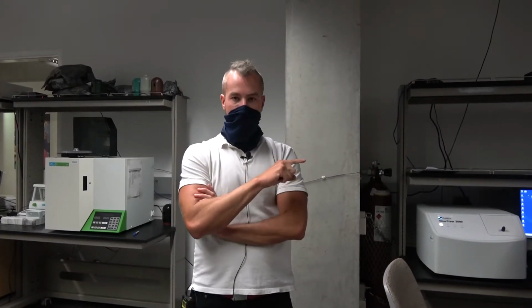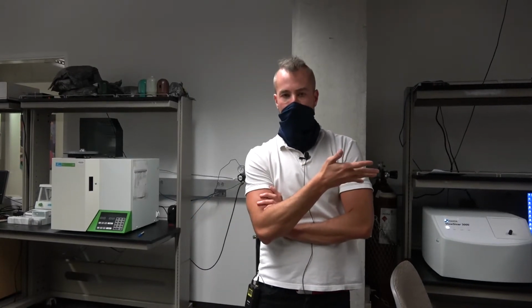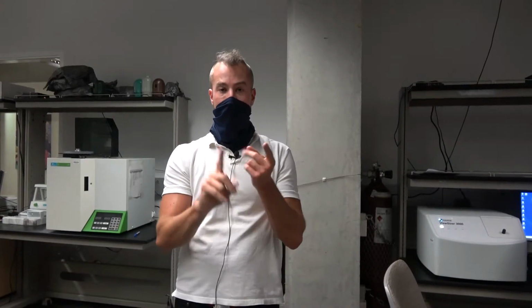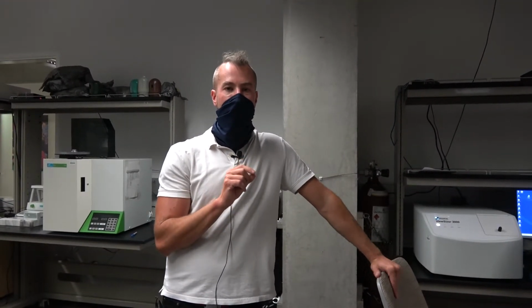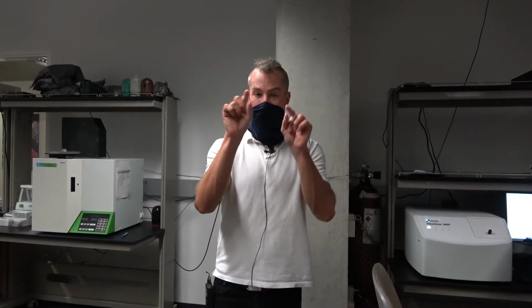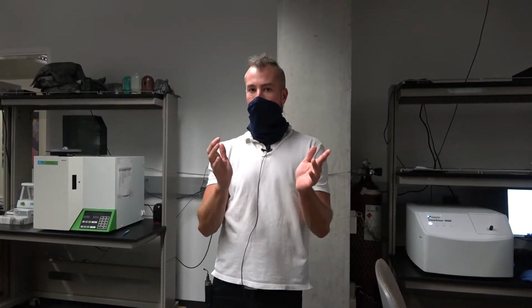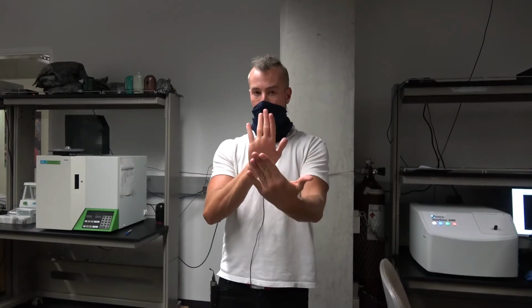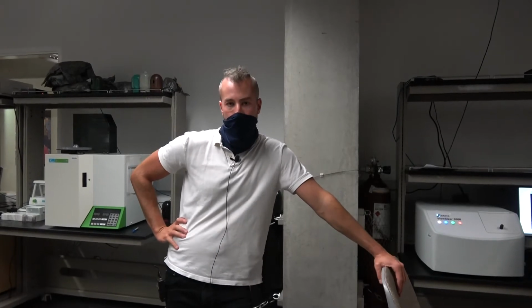But the other thing that this instrument does, which, I mean, this is going to be the third technique you've used how to size particles. You've done SEM, dynamic light scattering, and now this. So size is interesting. But what you can do with this instrument as well is you can count the number of particles, okay? Because you can individually count those little wiggling airy disks, and you know your illumination volume.